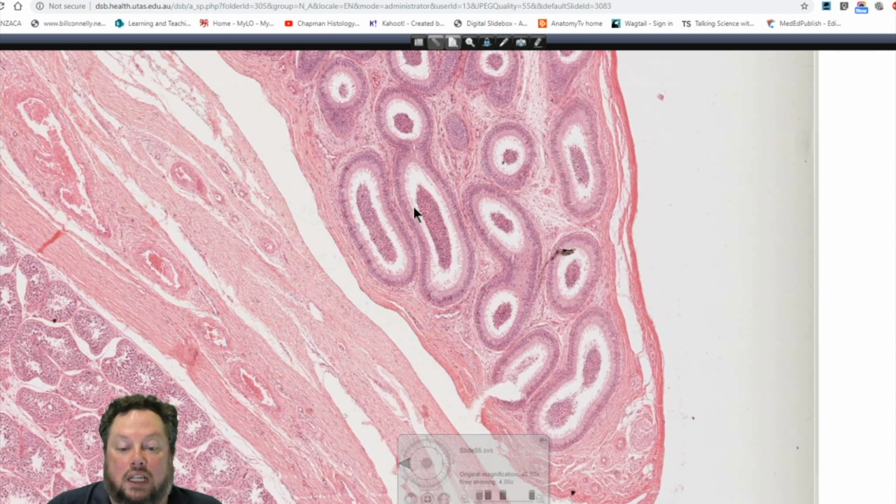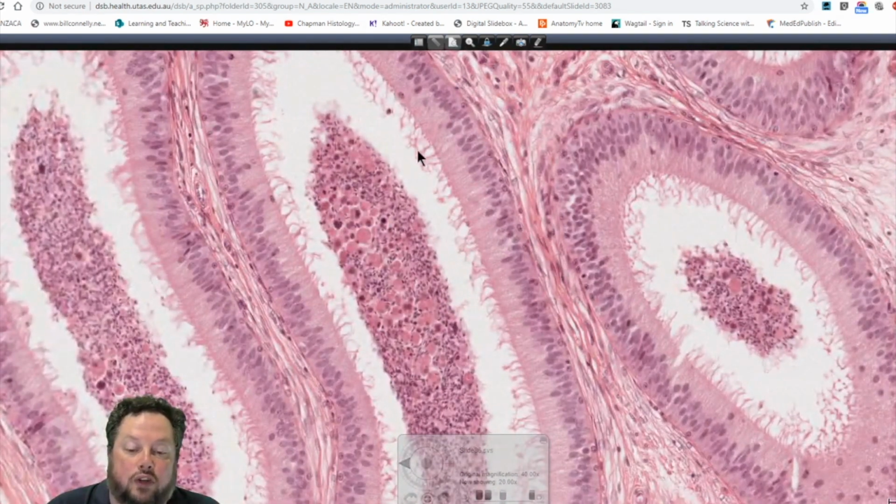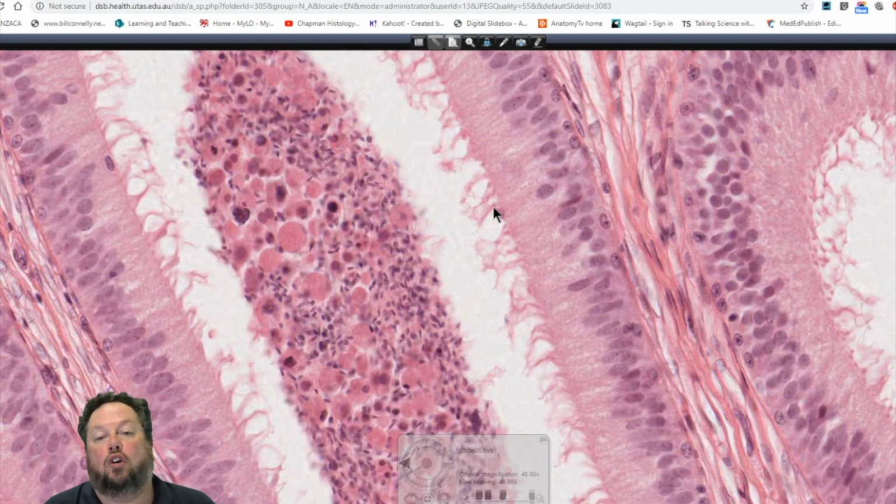It's a pseudostratified columnar epithelium, and it's one of the few sites in the human body that has stereocilia. Now, stereocilia, which are what these structures are here, are very, very long microvilli. So they're immotile. Unlike cilia, which have the motor proteins that help the microtubules move around, these are very long microvilli that have a core of microfilaments, but what they do have on their surface are enzymes. So they're kind of like a brush border of the small intestine, by having enzymes on their surface.